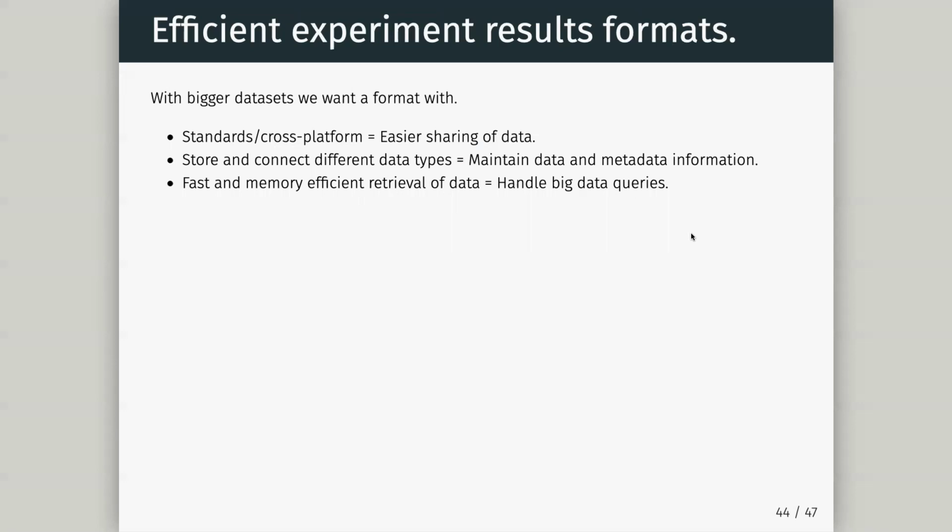There are some collaborators who will say, I just want to do this part of your analysis. And you go, thank you. What format do you need? This special Python related format? Then you have to learn that. We want a cross-platform type of object.